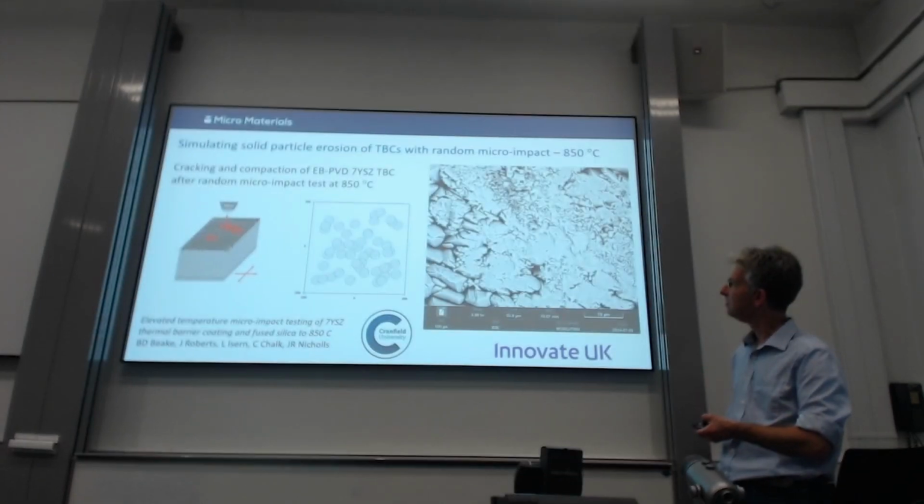And also we can do high temperature erosion tests, in repetitive impact tests to simulate erosion. And again, it's a collaboration. This is some unpublished work as yet with Cranfield. Okay, so thanks very much.